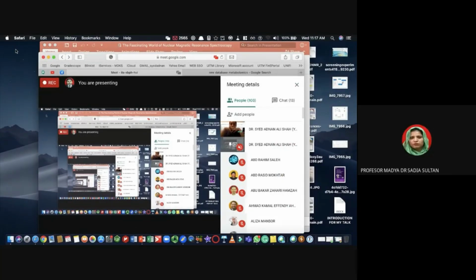Please go ahead. Okay, my question is regarding this virus, because you have mentioned in the last slides some research which is going on. They haven't made it clear to all, because maybe it is under progress. So they have done this DNA and RNA binding, they have shown with some drugs as well, right? As a chemist I know that we need some active nuclei in order to know the structures. So the virus doesn't have any nuclei, they are RNA and DNA based. So can NMR help to diagnose or screen for this nasty virus, because there is a lack of nuclei, and with NMR we cannot do without the active nuclei.